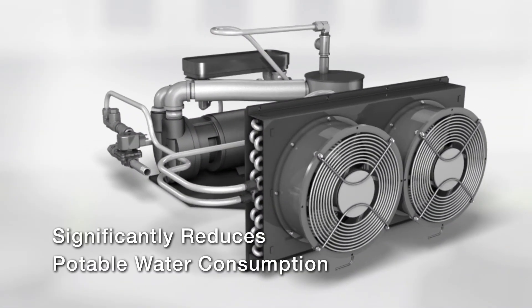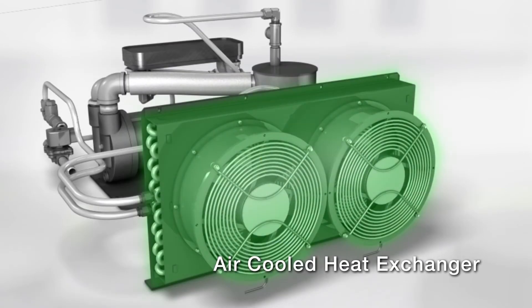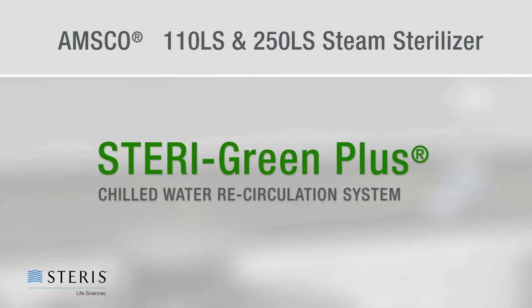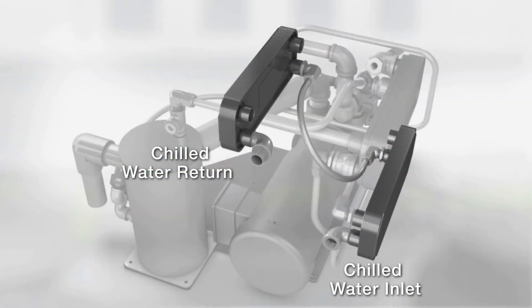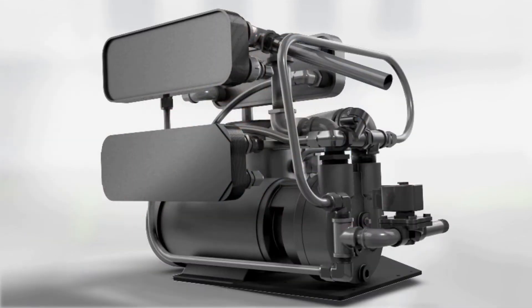To save water when utilizing pre-vacuum cycles, the SteriGreen option combined with a vacuum pump can provide up to 70% savings over a standard water ejector. For even greater savings, when connected to a building chilled water loop, the SteriGreen Plus can reduce water consumption by 99%.